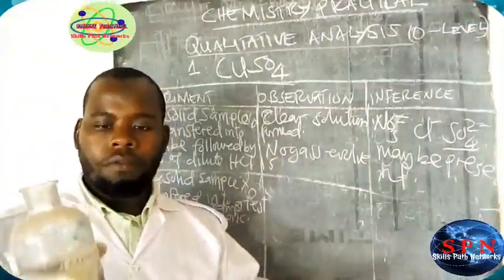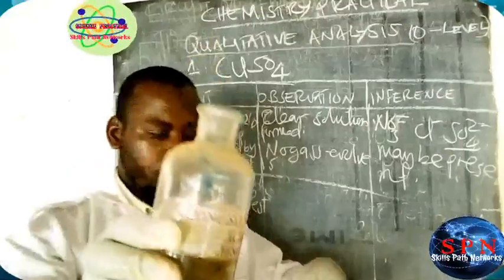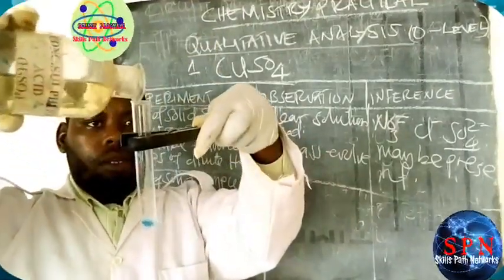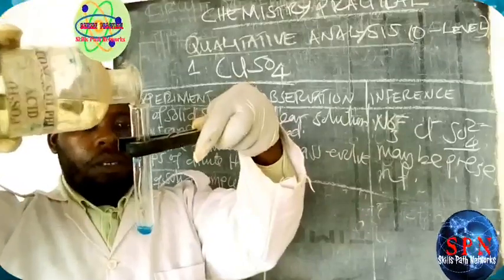This is sulfuric acid. Then pour. Then you are going to see the observation.